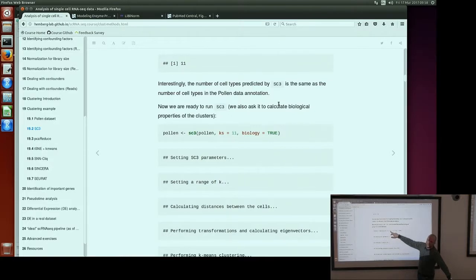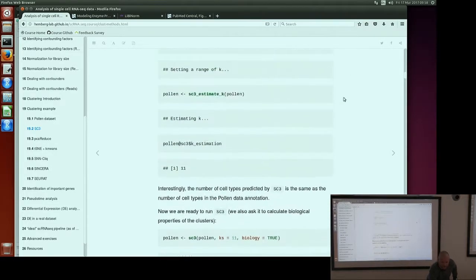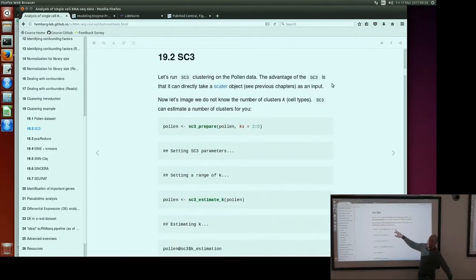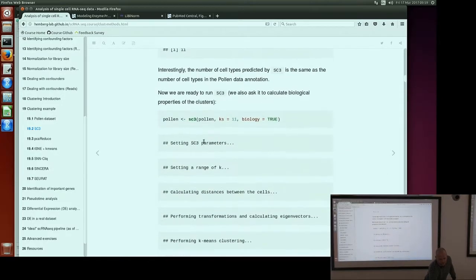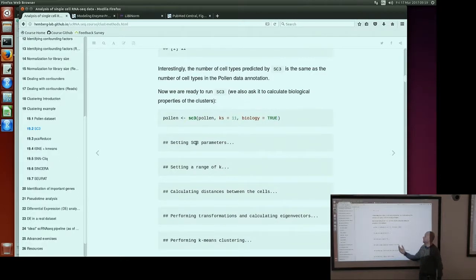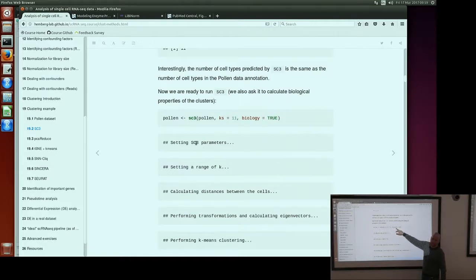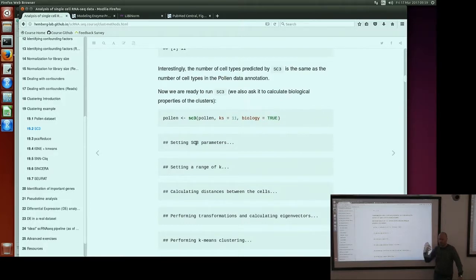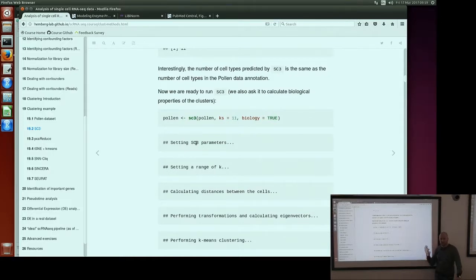SC3 also has a function which can estimate k for you. If we run it on this dataset, it finds 11 clusters, which is equivalent to the number of cell types reported by the authors — that's a good sign. Then we run the analysis using this number of clusters. Here I'm defining k as 11 just to save time. We also want to define the biology parameter — by default it's false, but if you set it to true, SC3 will calculate differentially expressed genes, marker genes, and outlier cells for the given k. For k equals 11, it will find all three of these.